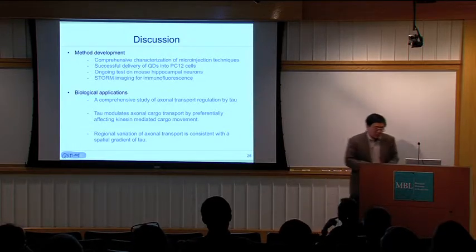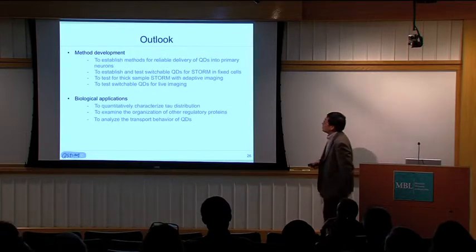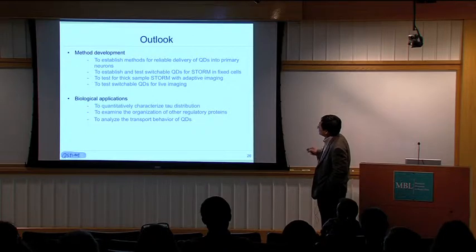Okay, so where do we go from here? What we're going to do next is further establish, in collaboration with Beth's lab, a method to really deliver these quantum dots into different cells. And also to establish and test the switchable quantum dots for STORM imaging in fixed cells.